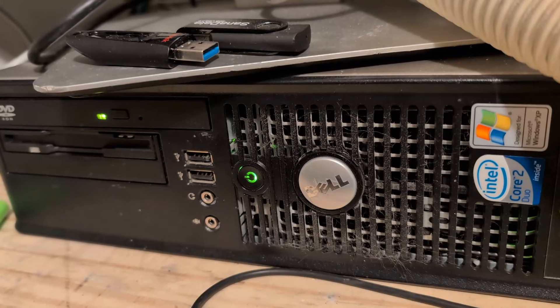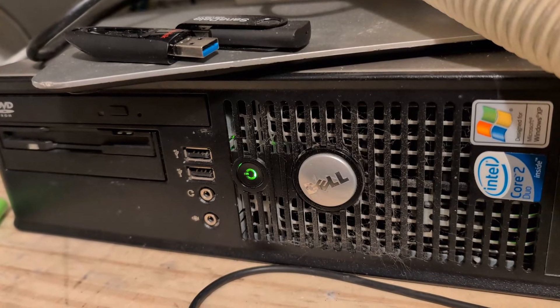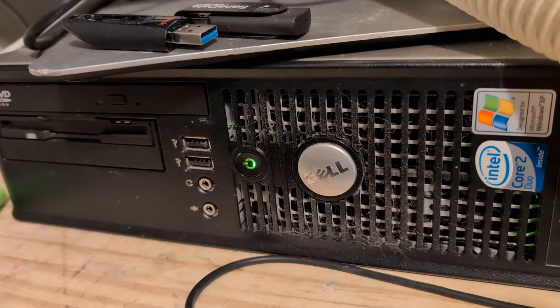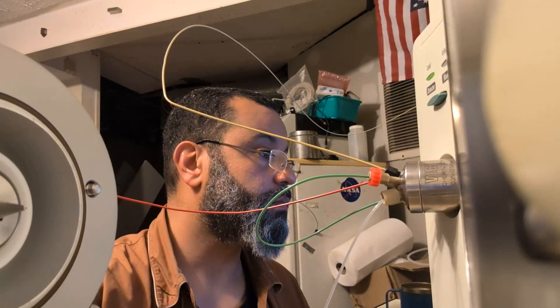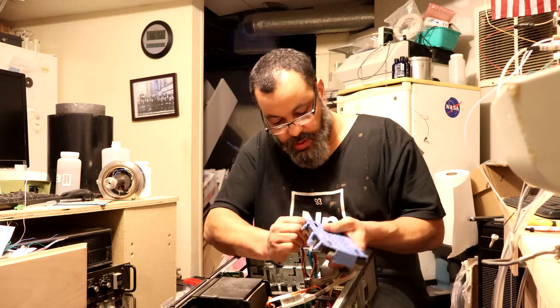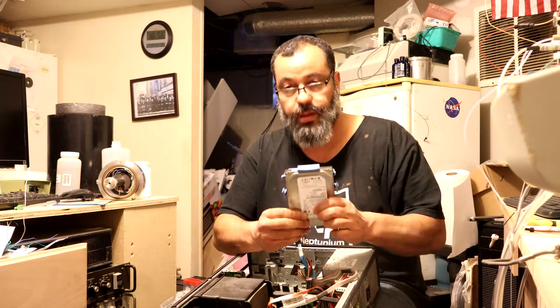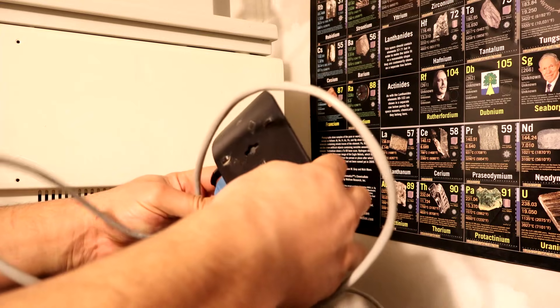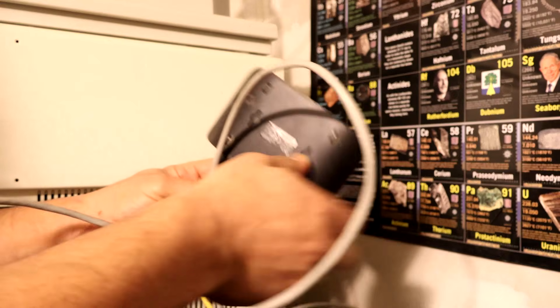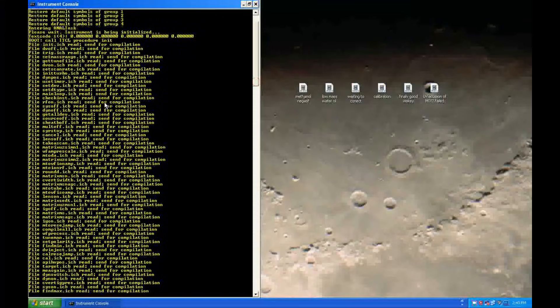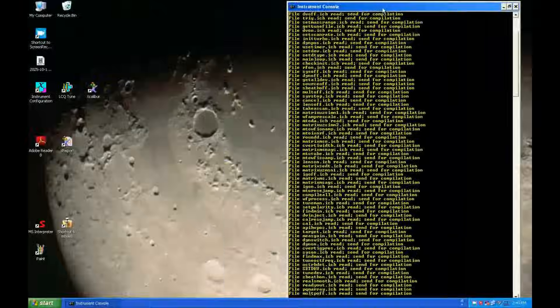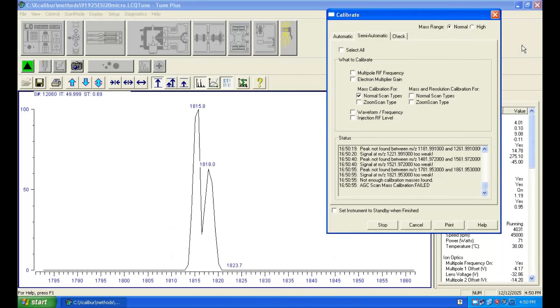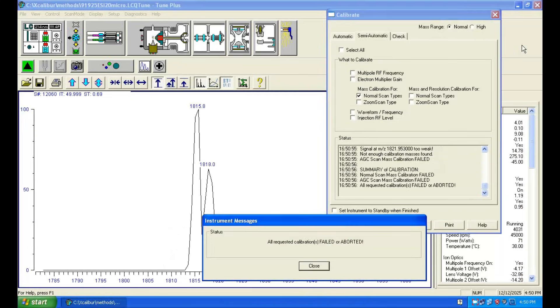Oh look, a 23-year-old refusing to work. I replaced the PC with a new Windows XP computer, reloaded all the software, drivers, backed up data from the hard drive, reconfigured network connections, worked out all the kinks and issues again to get a good tune but still failing mass calibration.